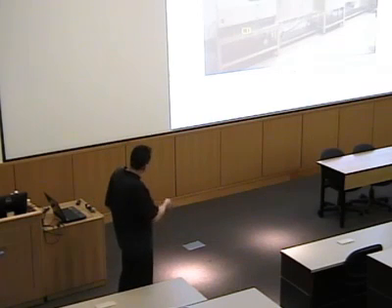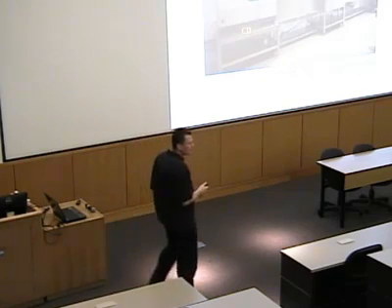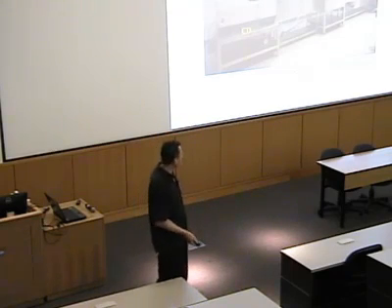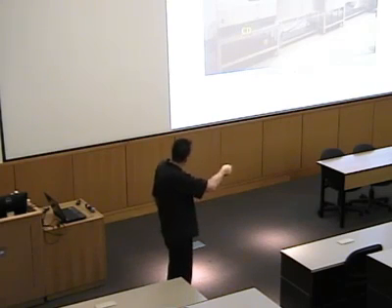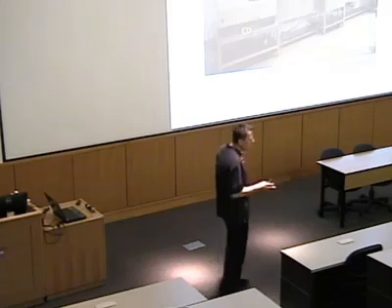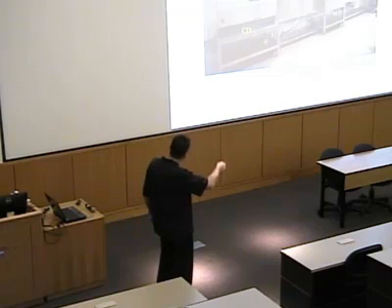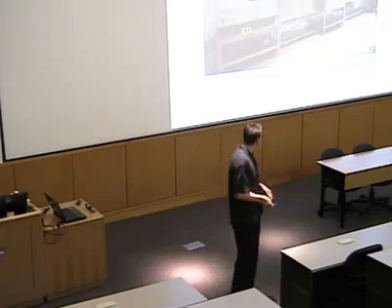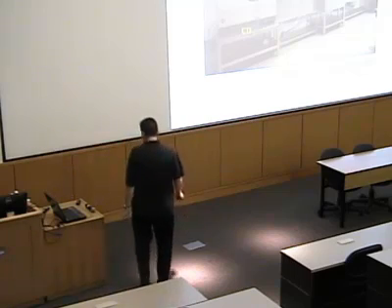Now, Oxford is the number one company who builds these kinds of cryomagnets, but they're not really good at shielding their magnets very well. So there is a very strong stray field, which requires that you put a little bit of distance between your sensitive spectrometer and detector and the magnet, right? So you might wonder, why is there this strange setup built out here? It's just to space this out a little bit and to have less of an effect of the magnet on your spectroscopic equipment. So we have about 1.5 meters here between the CD and the magnet, and then the detector is about another meter away, and that's just because of the magnetic stray field that comes when you ramp that magnet up to 7 Tesla, which is a pretty strong field. But that's the setup, so not too complicated.